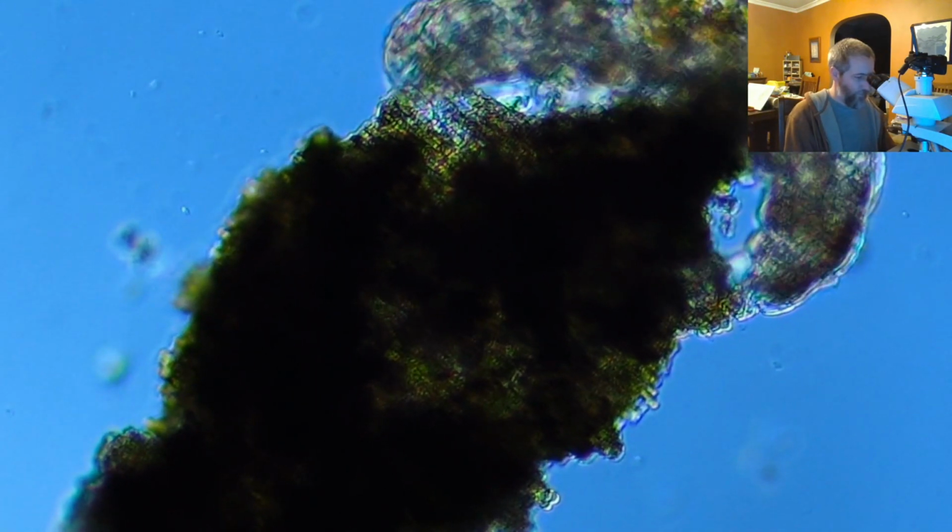I think that Mallory has decided that we're going to look at spices, food things in the scanning electron microscope, which is funny because, oh, here's another one. That's a big guy too. That's a different one than the one that we saw before. It's in a totally different place. Maybe?